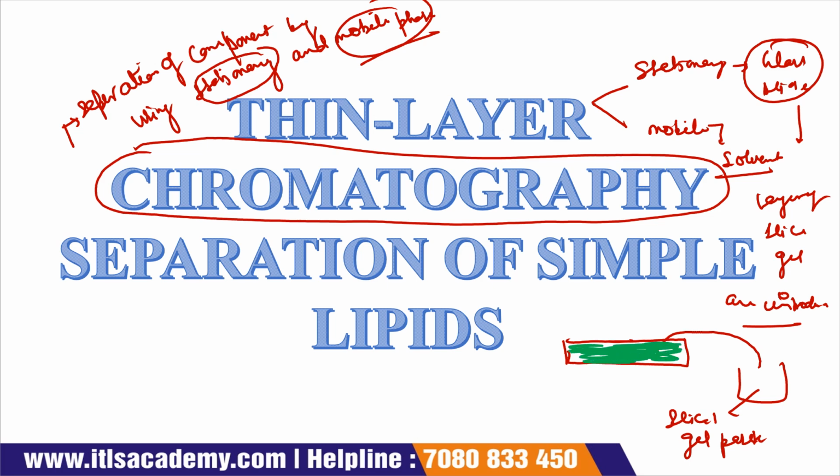When it dries, we make a line 1 centimeter above the bottom of the slide. Here we put a sample, and keep this slide in a solvent.